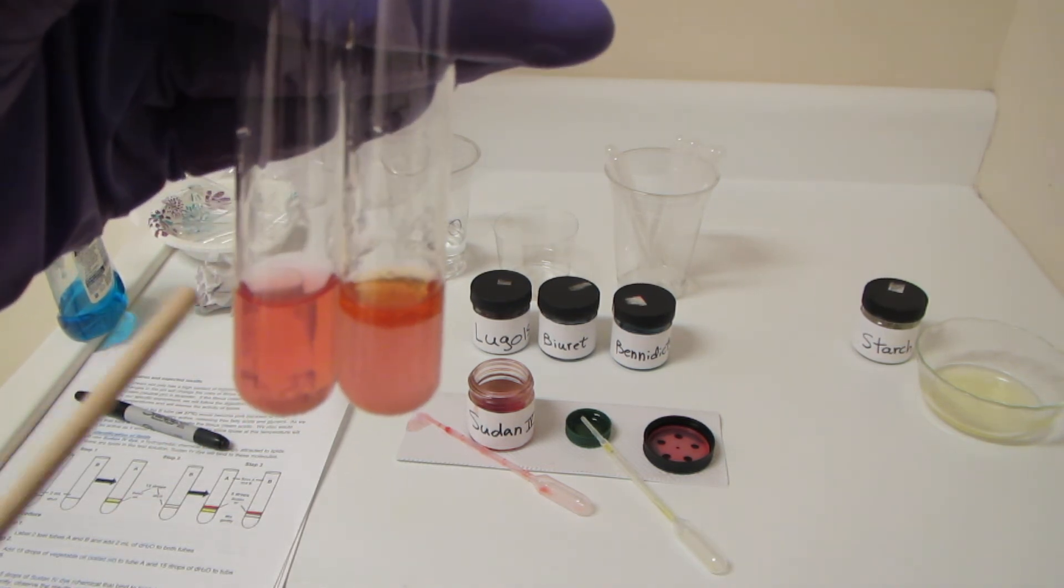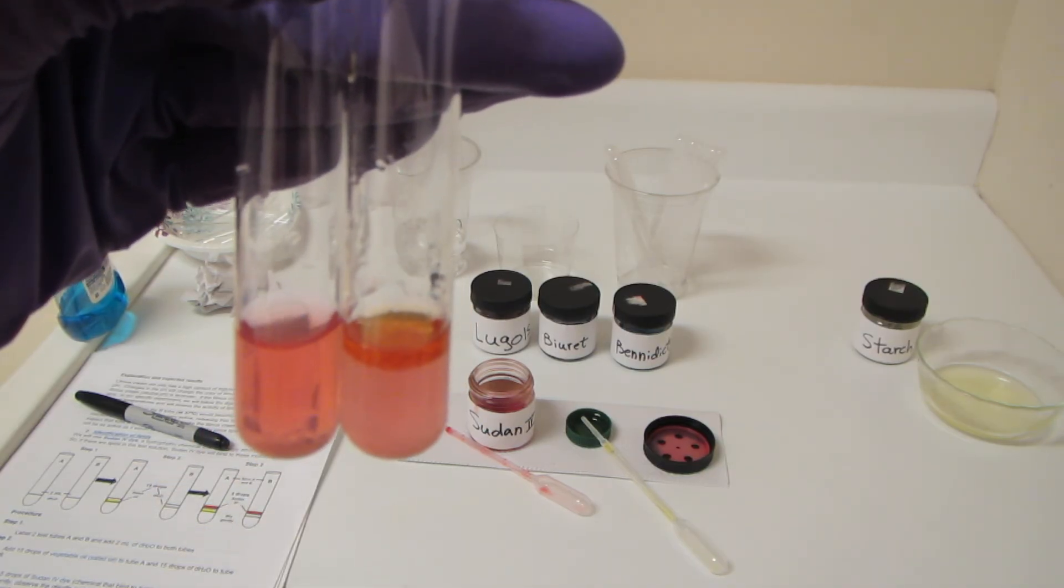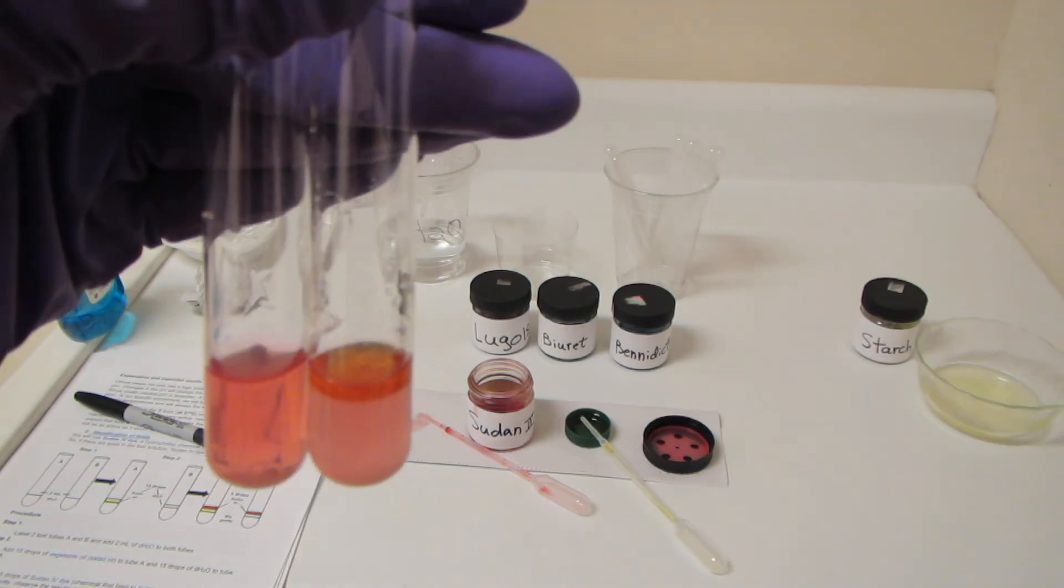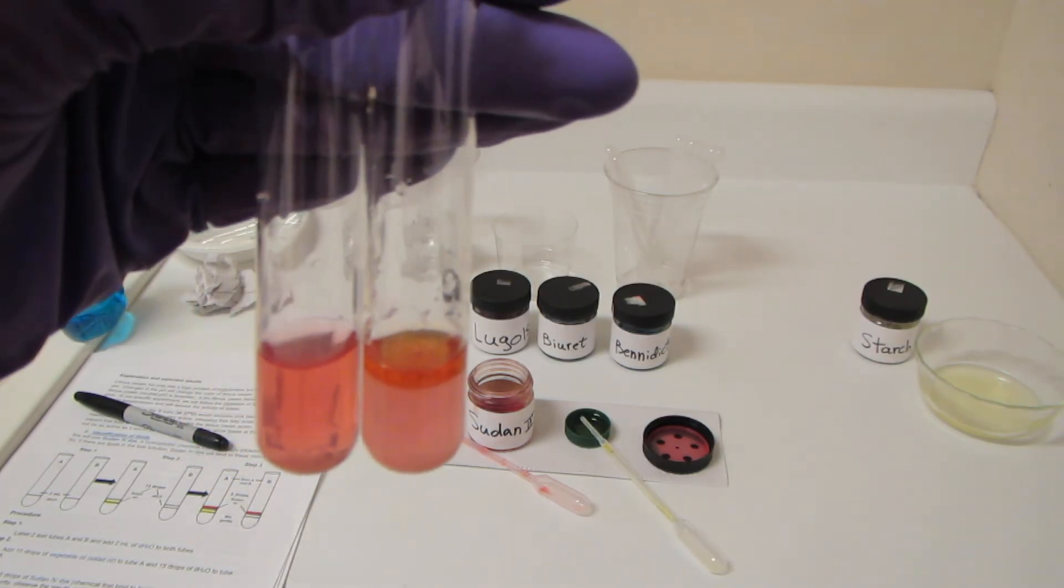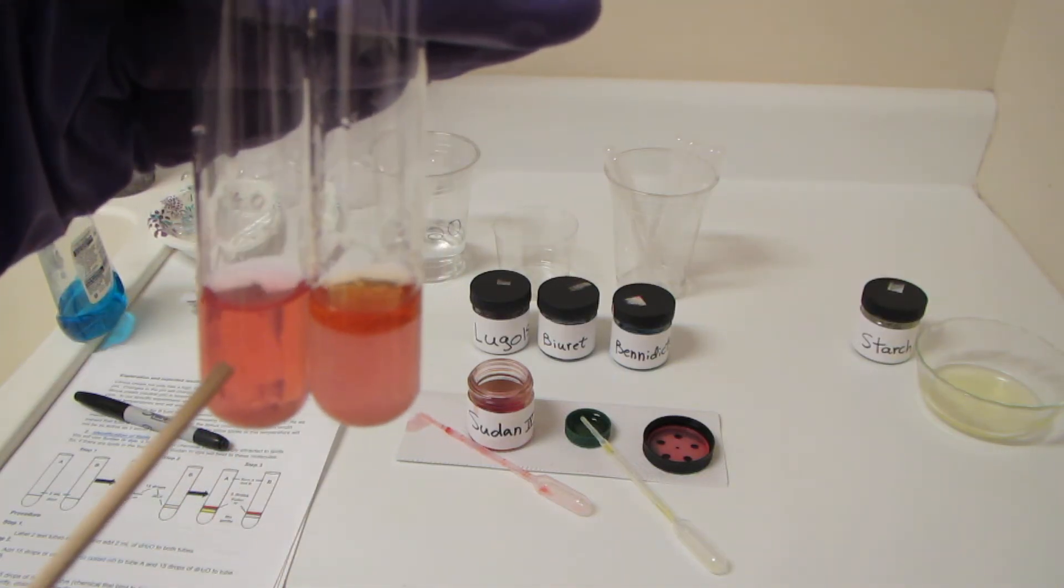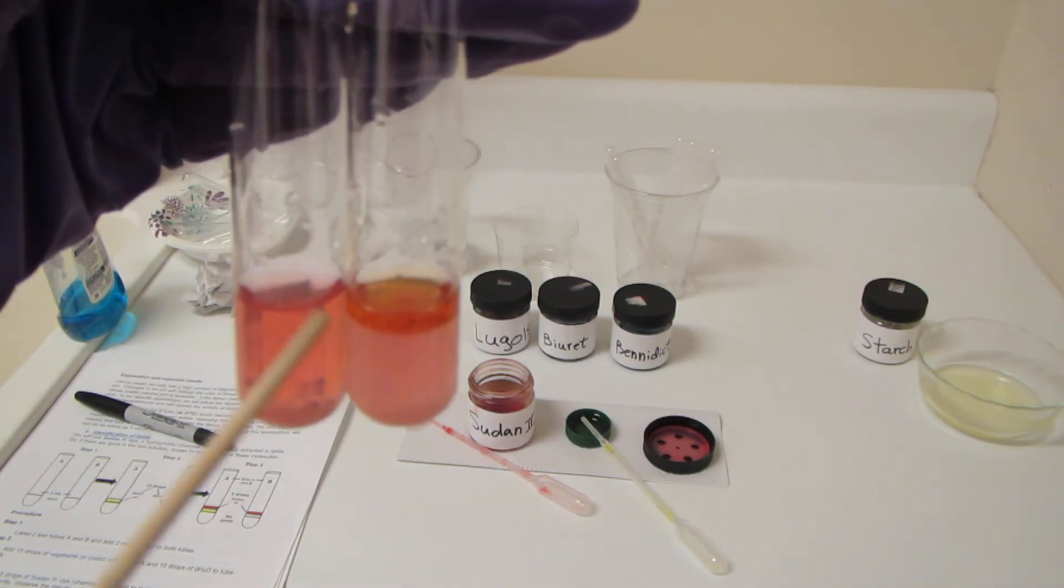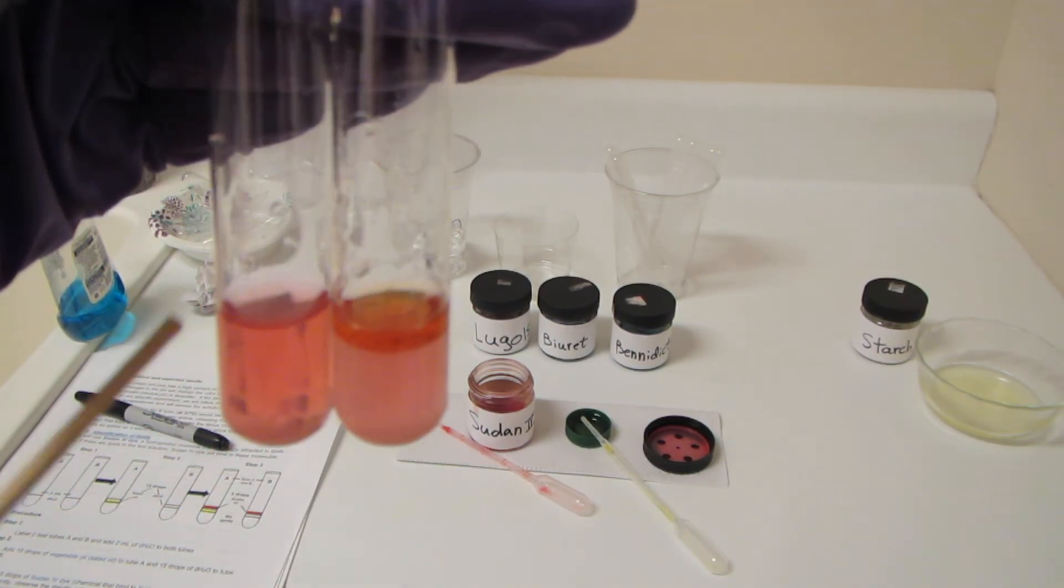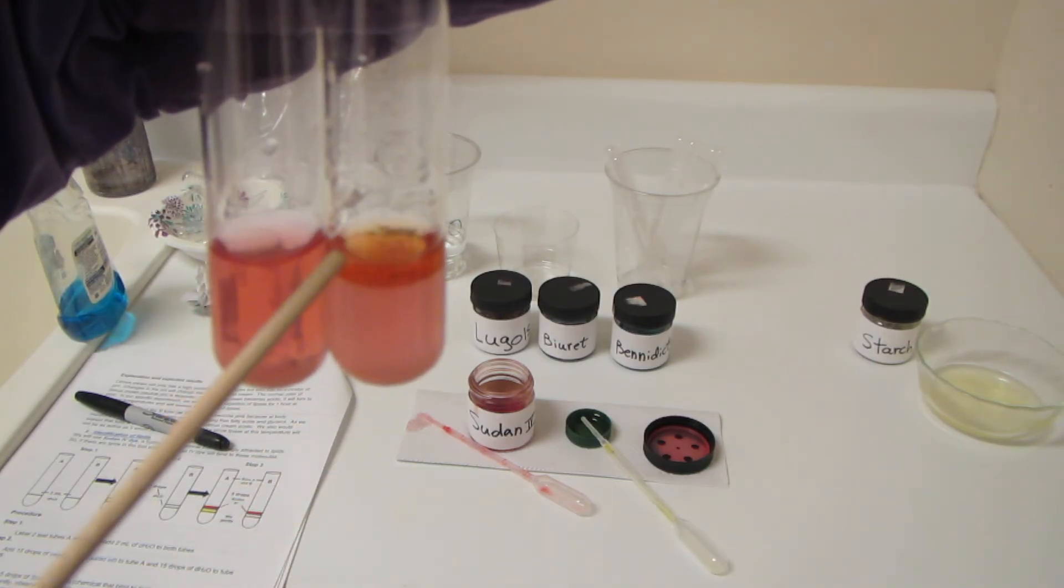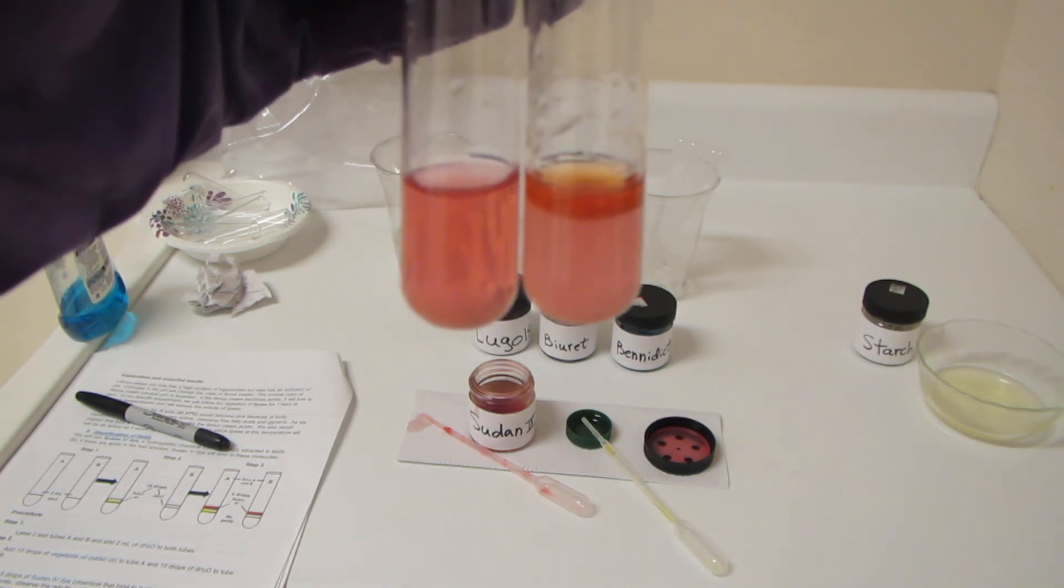Sudan 4 is what we call a fat-loving dye. It's what you would call lipophilic. It loves fat, so it's going to preferentially go up here into the fat. Whereas down here, there's no fat, so it's just basically spread out throughout the water. But over here, it's preferentially going up into the fat, so we're getting that beautiful magenta mark there.